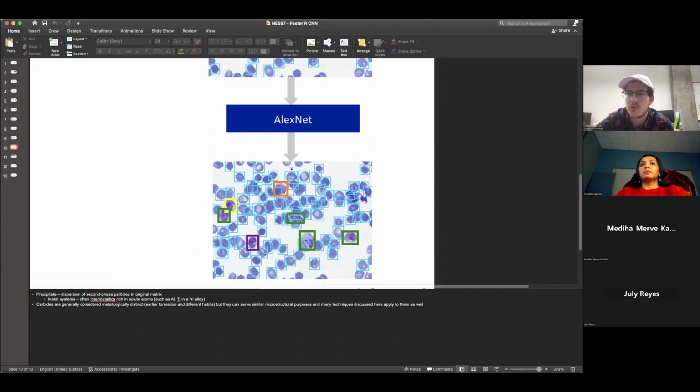They have a significant amount of data to isolate what is or isn't a red blood cell, but following that, actually characterizing what the different cells are, they didn't explain super well why they did this. But with the use of AlexNet, they had a sufficient database that they could basically get better results that way. I didn't have a great understanding of why they did it though.